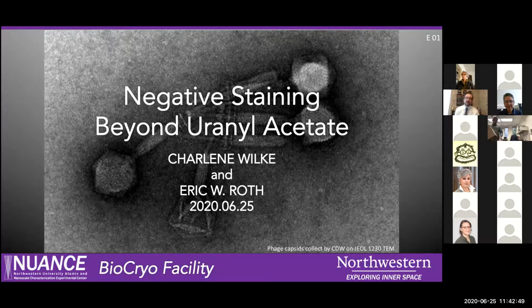All right, Charlene, you want to take this next one? Jessica Walker asked, how should we dispose of excess uranyl acetate? So how much is excess? We have, and I don't remember if I actually said it or not, an area in the 5150 where people are doing some negative staining, and there are containers for the solid waste, or things that have come in contact with your UA and such. So a larger container, and then we have a container for liquid uranyl acetate.